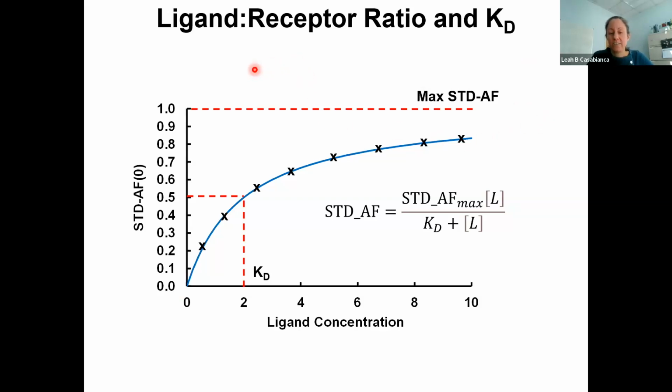So a lot of times in NMR, we are limited in the different ligand concentrations that we're able to measure. On the low end, we know that we're all limited by the low sensitivity of NMR. And remember that even if you may be able to observe your ligand at the concentration that you like, the STD effect is a fraction of that signal intensity.